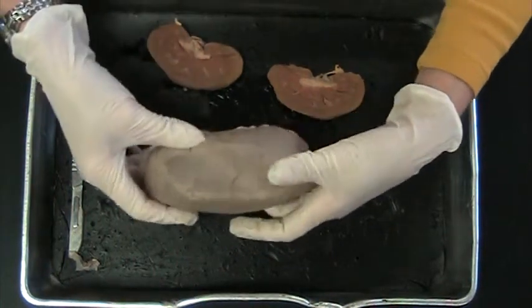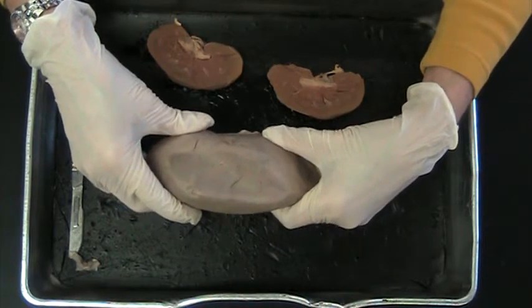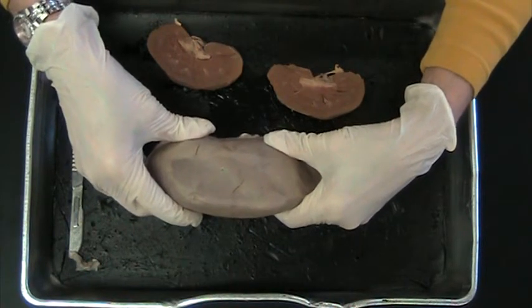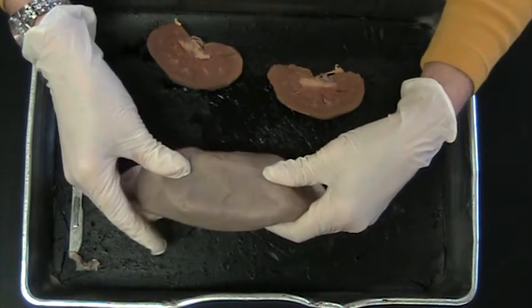Hi guys. Obviously I wish you were here to do the dissection, but instead I'm going to do a bit of dissection of the kidney and hopefully be able to point out some of the parts.